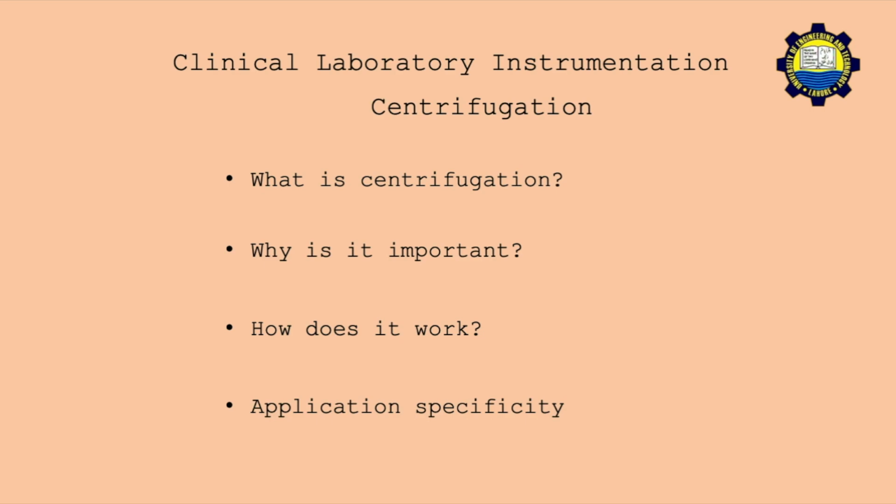Different types of centrifuges are used for particular applications, and that is going to help us understand the application specificity of centrifugation equipment.